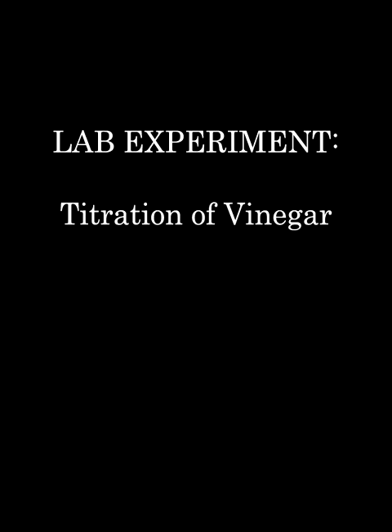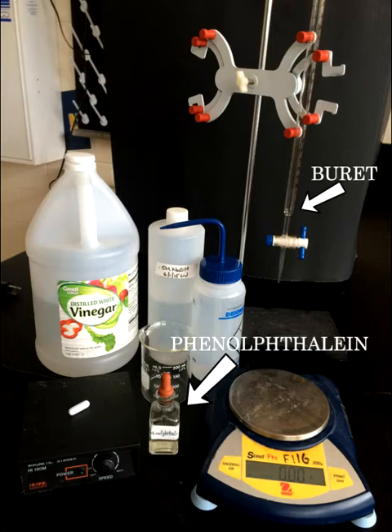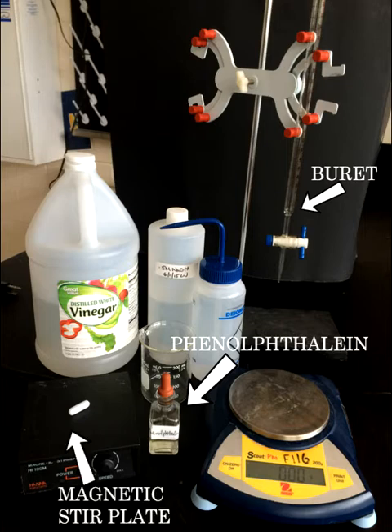In this experiment, we will be titrating vinegar, an acid, with sodium hydroxide, a base. Here is some of the equipment we'll be using. Some of the more unusual items include the burette, which is used to add a solution drop by drop, phenolphthalein, which is an acid-base indicator, and a magnetic stir plate, which helps to keep our solution mixed constantly.